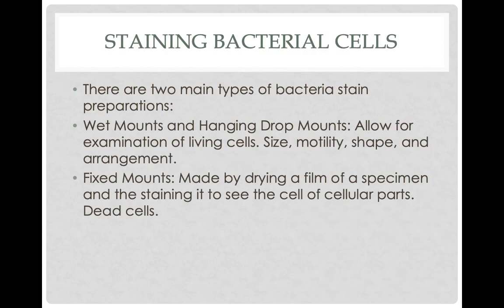So anyway, bacteria. When you want to look at bacteria underneath a microscope, it's really difficult to just take them off a petri dish, stick them on a slide, and look at them underneath a microscope. They're alive. Some of them produce toxins. You don't really want to use living bacteria underneath a microscope. You could contaminate yourself for the microscope, which could contaminate whoever uses it later. You could contaminate the environment. Anything like that could happen. So we don't really like to use living bacteria underneath a microscope.